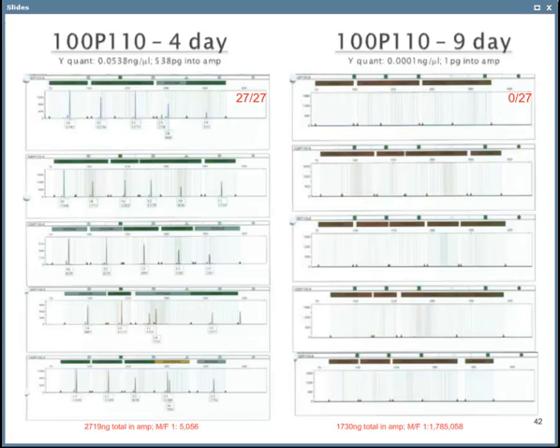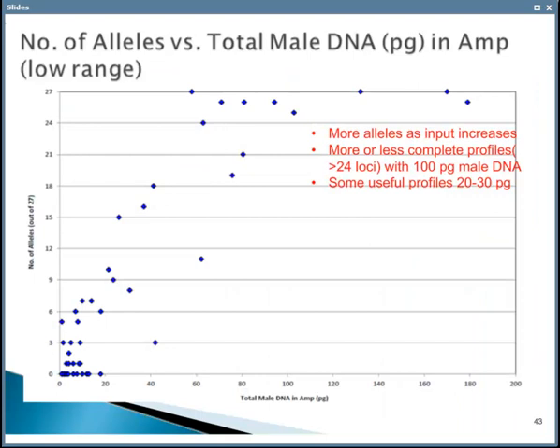But we normally wouldn't proceed with that sort of information. But in this case, we did this. We typed all of them to see what the results would be and how it correlates with what the prediction would be from the Quant results.